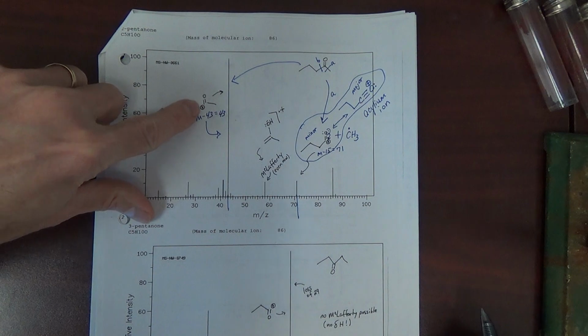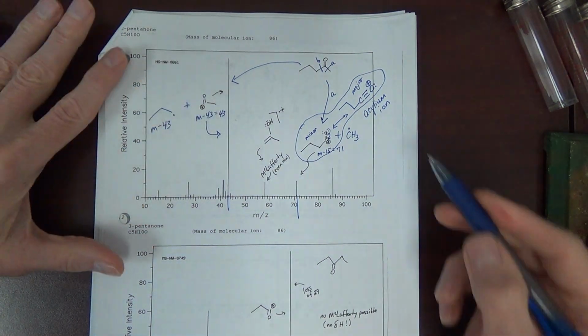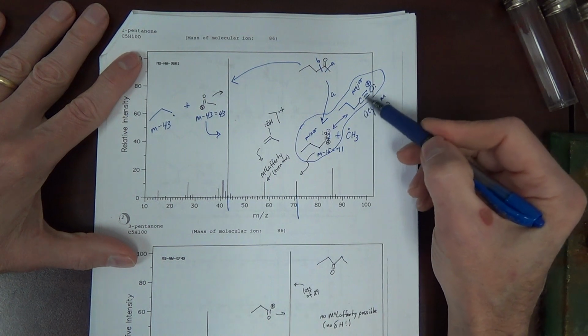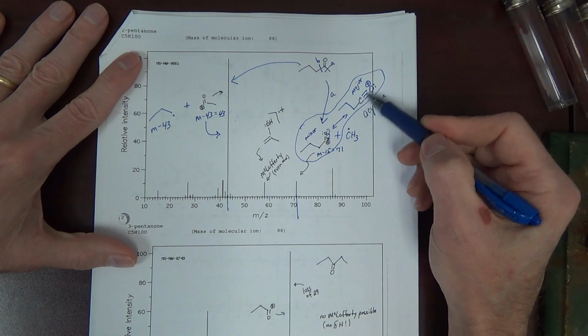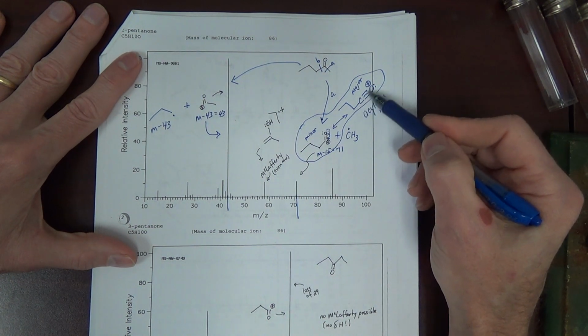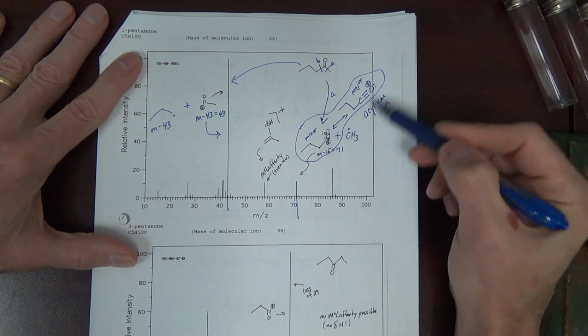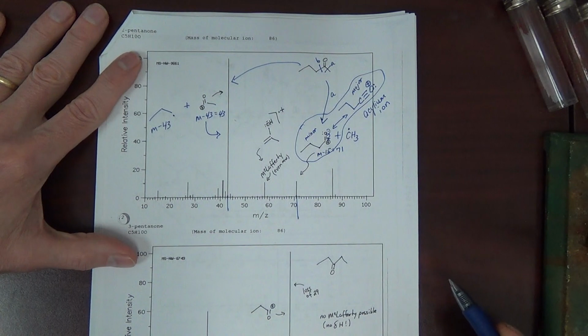You should be able to draw a resonance structure of this acylium ion. We know that this is the major resonance structure of the acylium ion, right? Very important to know the structure of this ion.